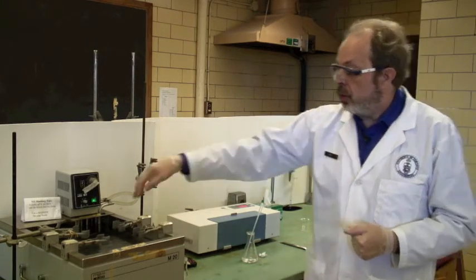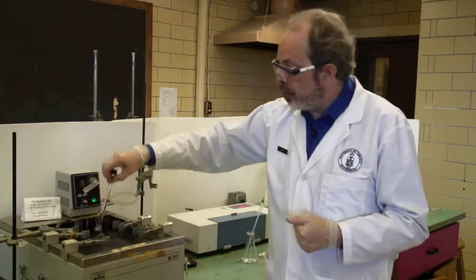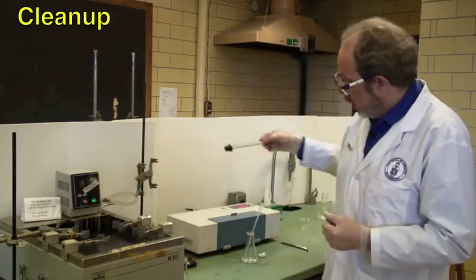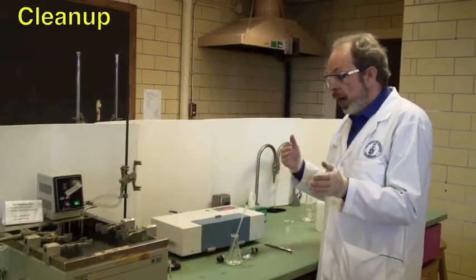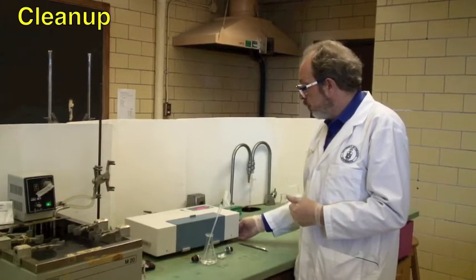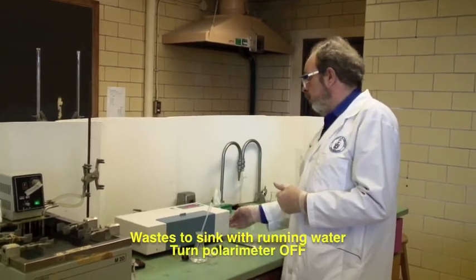When you have finished, all you need to do is take everything out. It's just sugar and mild acid solutions. Everything gets poured down the sink and turn off the polarimeter.